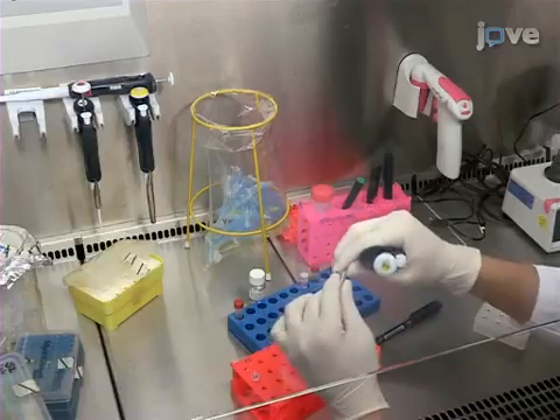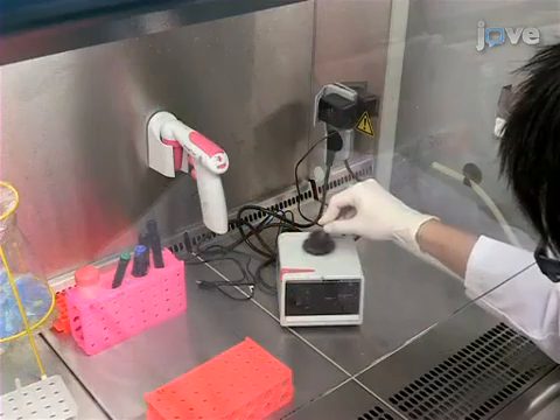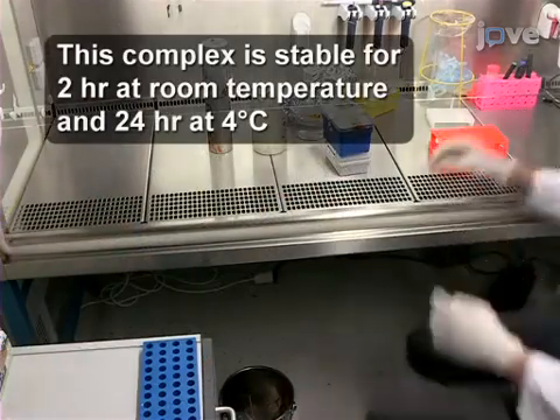Next, add the siRNA solution to the PEI solution all at once and vortex gently. Then incubate the mixed solution for 15 minutes at room temperature.